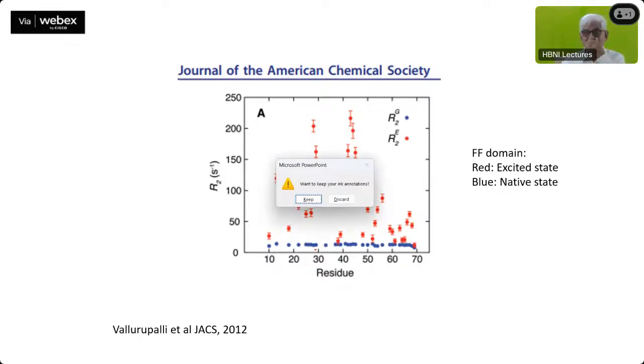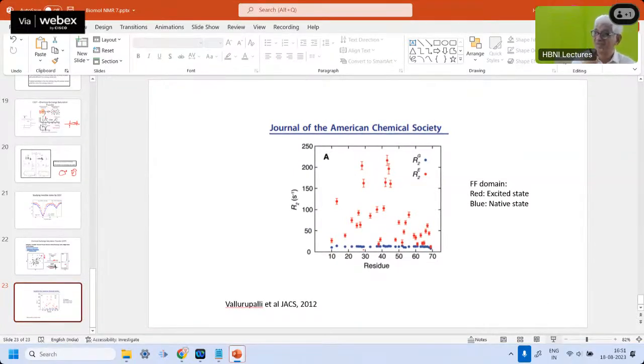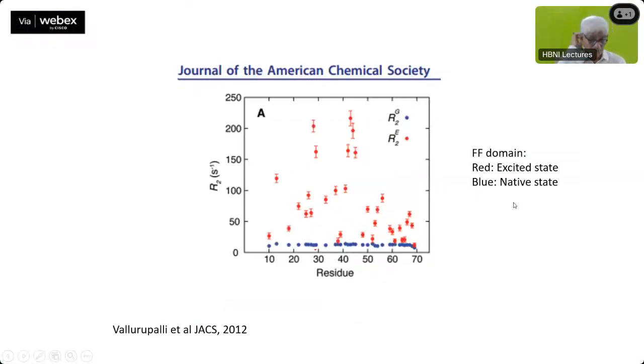That's right. And of course, you can change this power also. The B1 field irradiation power also you can change. Therefore, you do the experiment at more than one power levels. So you can increase initially and then you can fine tune. Okay, so this finished, you put the next one.